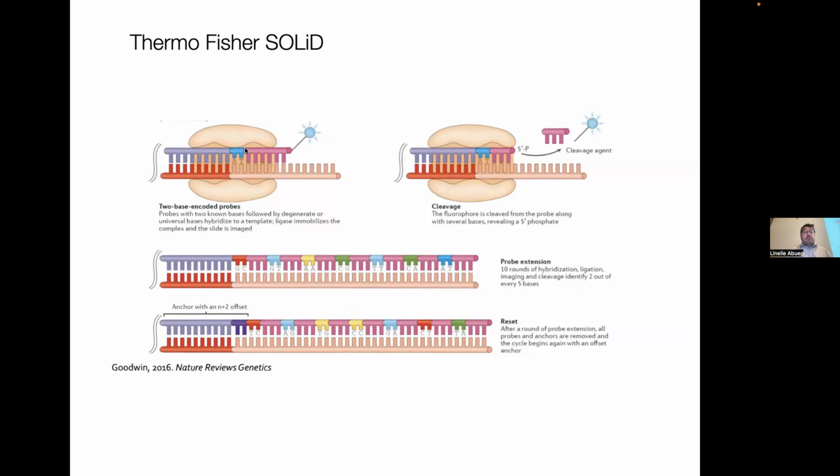So the sequencing reaction would be this 6 base pair degenerate oligo with 2 base pairs, right? So it's going to bind, and you have a signal every time it binds. And you keep going, you ligate 10 times in a row. And with the color, you can know exactly which one it was, which duo it was. If it's red, it's a GC, if it's blue, it's a GT, if it's AA, it's a yellow, etc., etc.